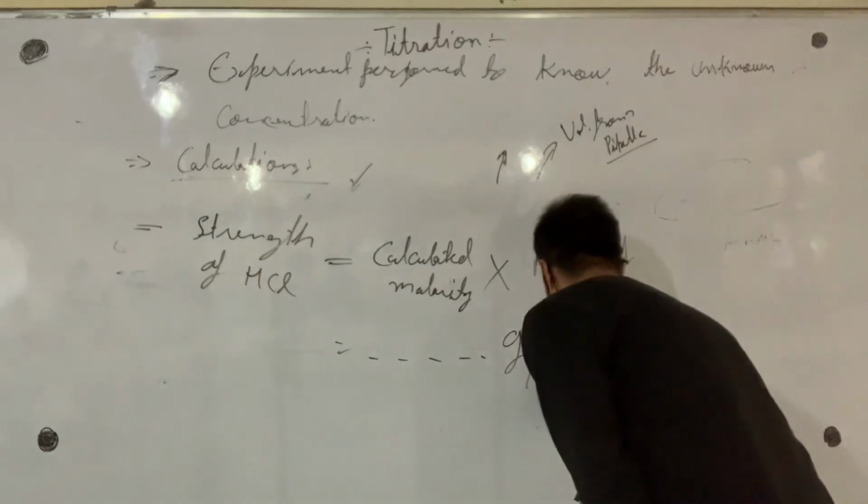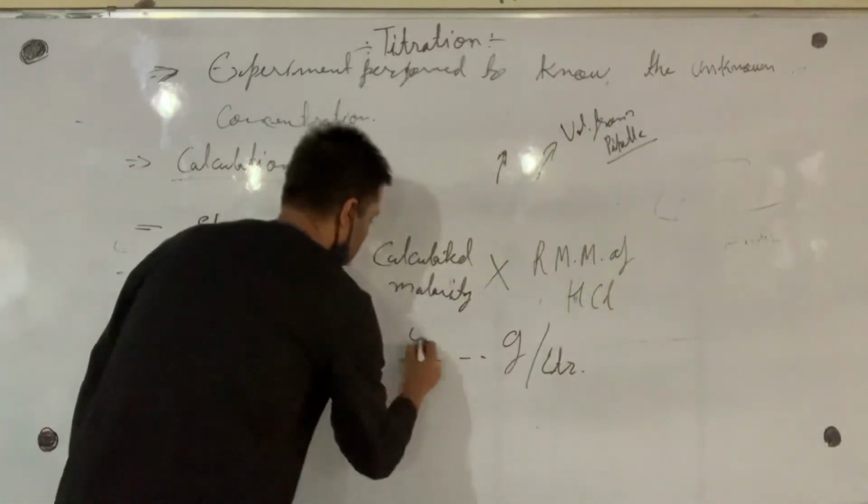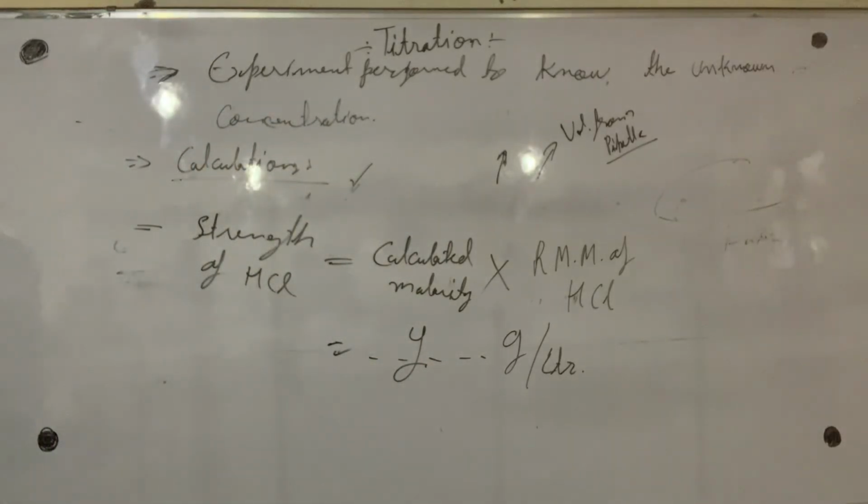Suppose this is Y. Gram per liter will be the unit.